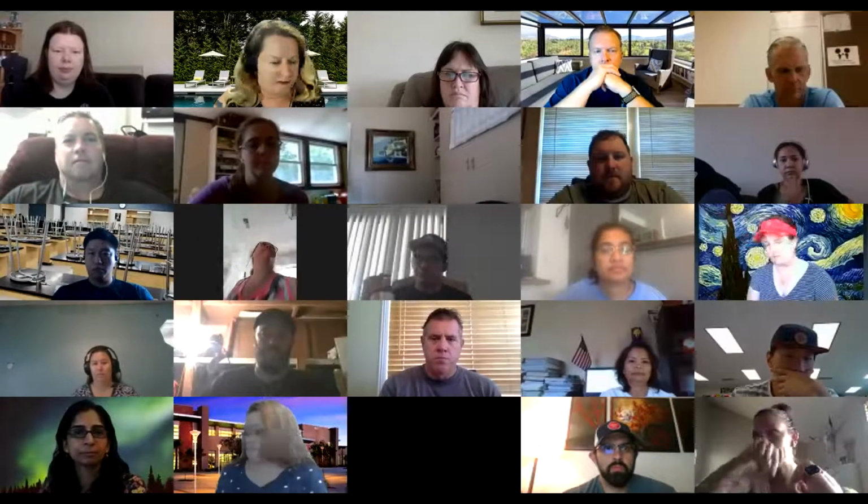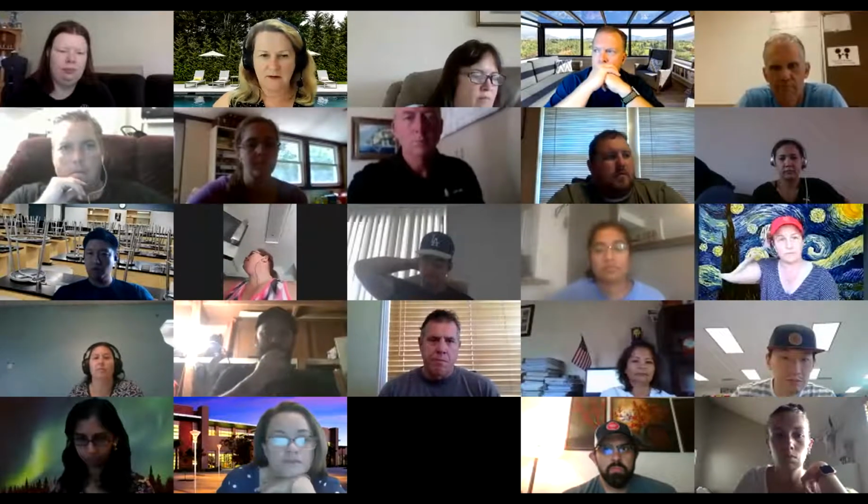Okay, I'm recording now. All right, so let's just look at the agenda for day 3. We're going to do a couple more labs today. So in the morning, I'm going to set it up a little different. Instead of starting out with the breakout groups, I'm going to start out showing you how to pour gel and run the gel. And as the gel is running, and the system I'm going to use is the MiniOne system, and I'll talk more about that later. It only takes about 15-20 minutes to run the gel.